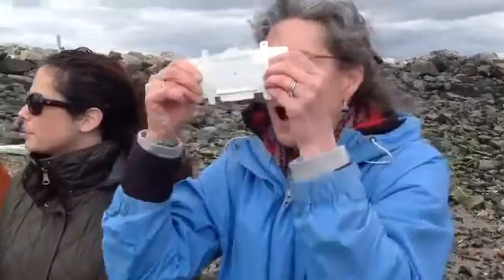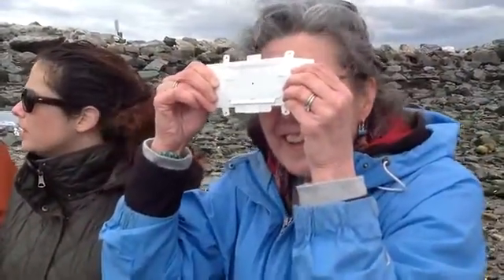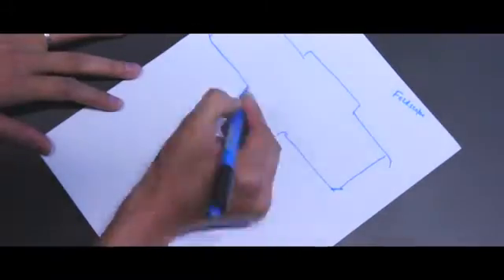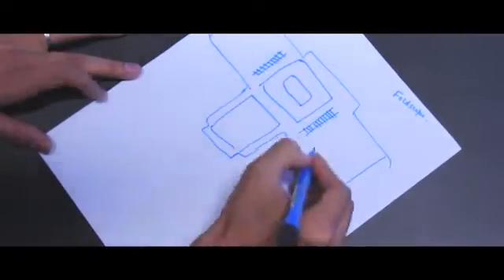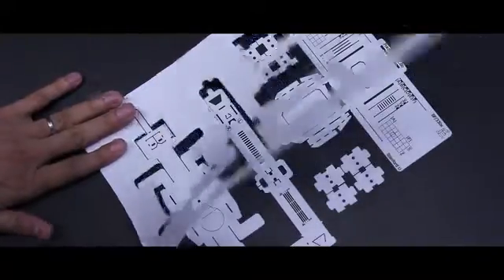One of the challenges that we face is the fact that this experience of curiosity-driven science is hindered by the accessibility of scientific tools. We care about Foldscope because we want to make scientific tools available to as broad a community as possible around the world. I literally compare something like this to a pencil — you carry around a pencil and in a moment you want to jot down a thought. Very similarly, Foldscope is literally a pencil of microscopy.